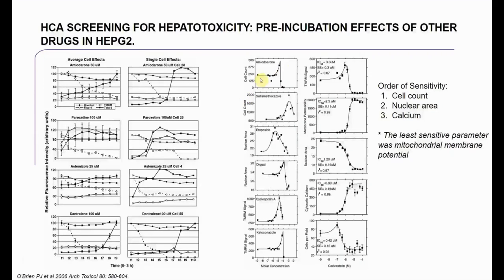Another thing that was highlighted was an effect known as hormesis. Hormesis is where you get an initial increase in a value with dose, but then it starts to go back down again. And so if you were to try and plot dose response curves with the normal models for these kind of responses, you're not going to get a curve. A normal curve would look like this, and that works fine with the standard methods. But with these types of curves, you have to come up with a better model in order to fit curves for these. And these are consistent responses. You see these reproducibly, and so they actually used a different model in order to take account of these types of responses. And so these sorts of things were very important.